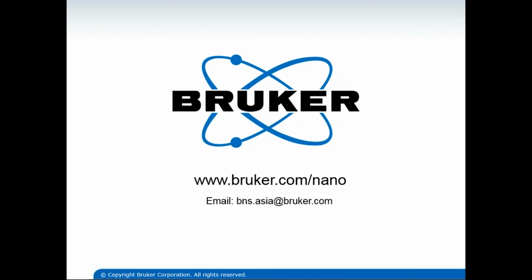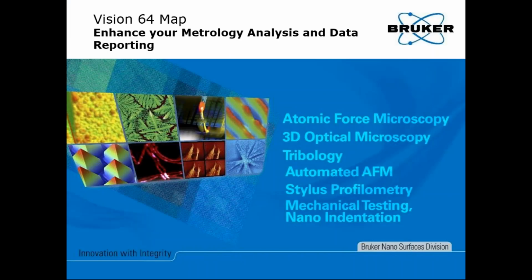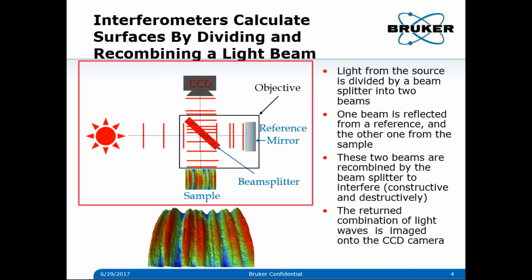Let me go back to the first slide here. Interferometry, if you go to Google, you type white light interferometer. So this is the technique here.